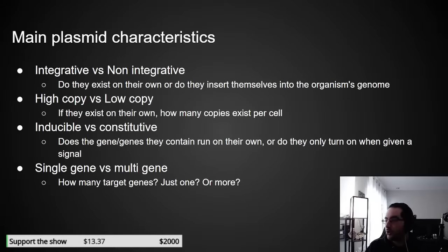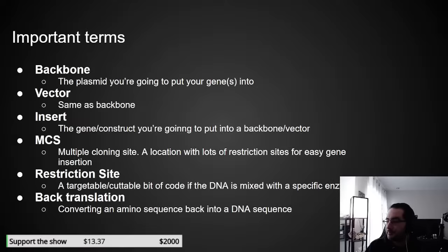So yeah, generally, if you're working with plasmids, in the range of 5,000 to 8,000 base pairs is really comfy. Any more than that, you're getting into the weirdness. Lower than that is fine. And, you know, I've worked with some really, really tiny plasmids. But at the same time, it varies. Just a thing to be aware of.